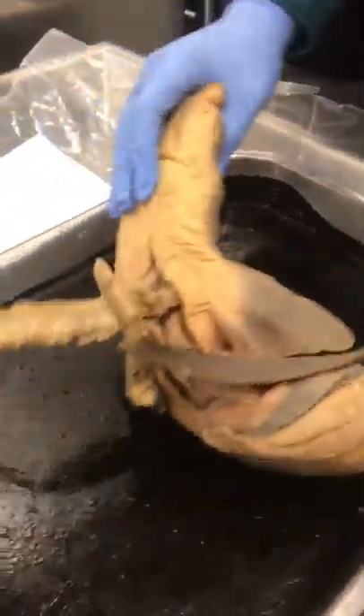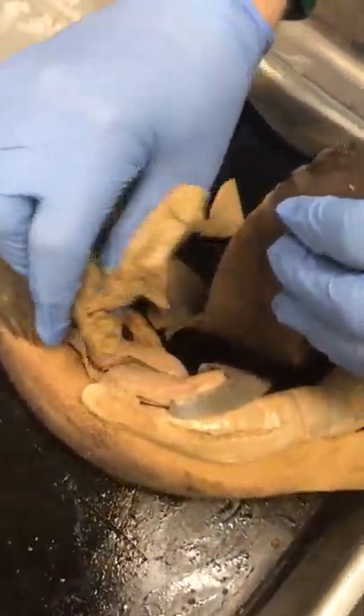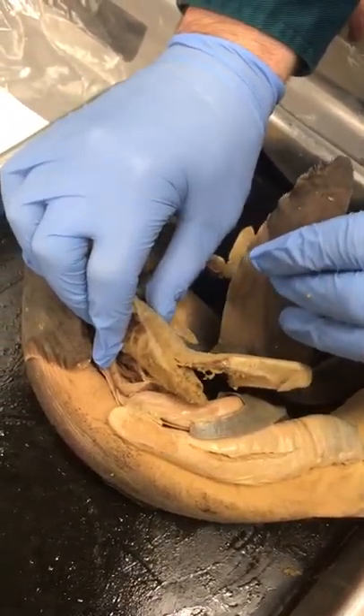Then you want to know about the livers. Livers — that's disgusting. Livers always have this kind of texture to them. These would be the shark livers for the dogfish shark.